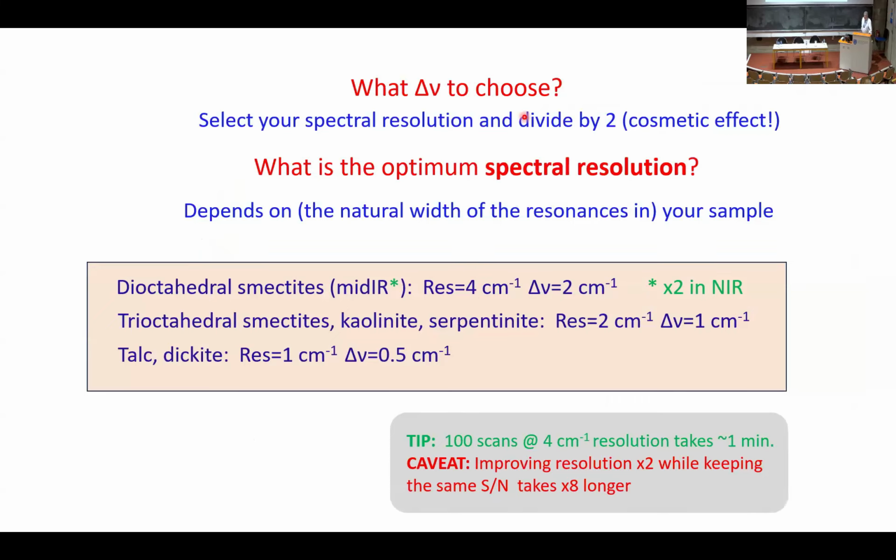Okay, so the practical question is, how many points are we using for our derivatives in clay science? And this problem is related to what Bruno was saying, how many points you need to describe a peak, an XRD peak in his case.